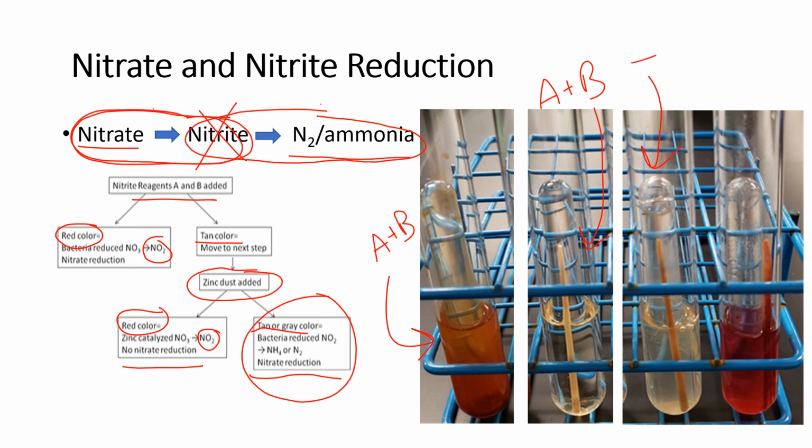So this is positive for nitrate reduction and positive for nitrite reduction. If instead you add the zinc and it turns red, that means that nitrate was still present. So that means neither reaction occurred.